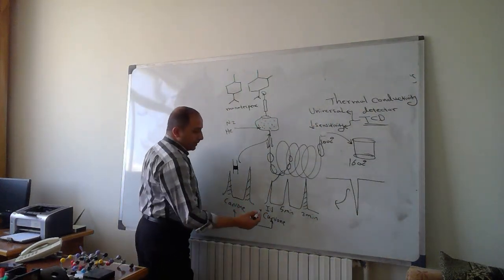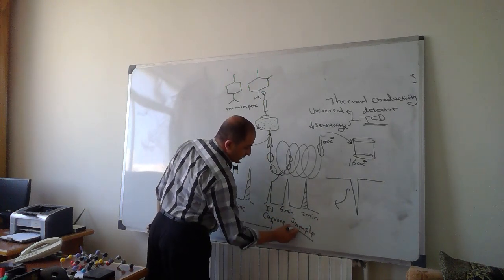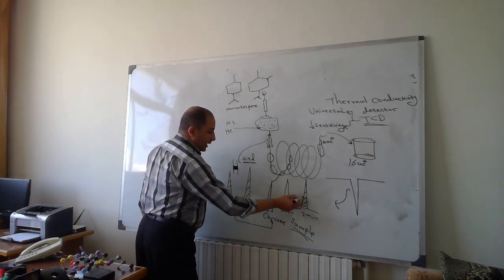We can compare. Now this is the sample, this is the standard. We can immediately compare the area under the curve.